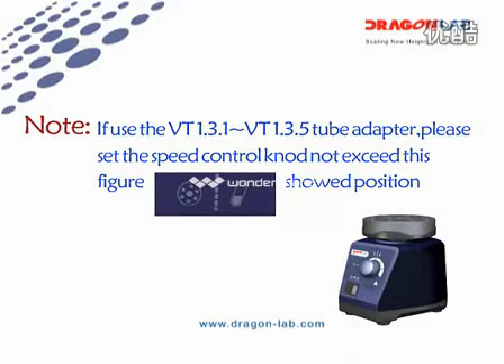If you use the VT1.3.1 to VT1.3.5 Cube Adapter, please set the Speed Control knob in the correct range.